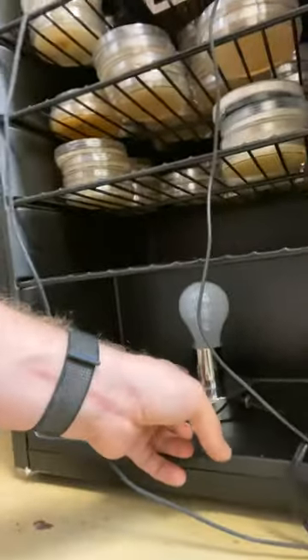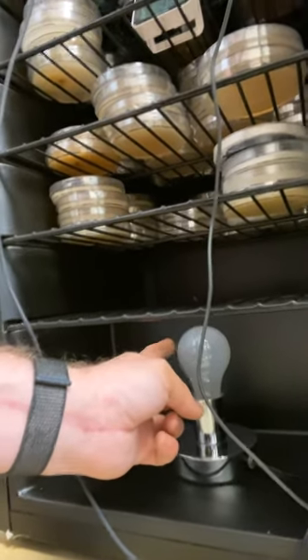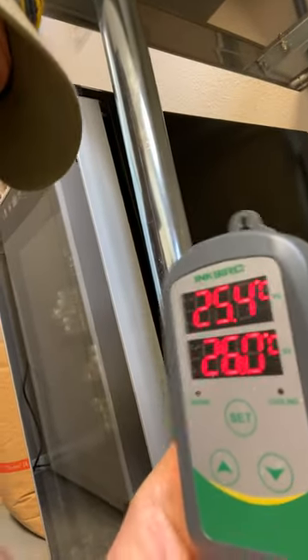What I have here is a beverage refrigerator. Inside I have a light fixture with a 100-watt light bulb. Then I have a temperature sensor that is connected to an Inkbird temperature controller. This is currently set to 26 degrees Celsius, which is apparently about 77 degrees Fahrenheit according to my thermometer — which is woefully inaccurate, but I'll take it for right now because it's consistent.